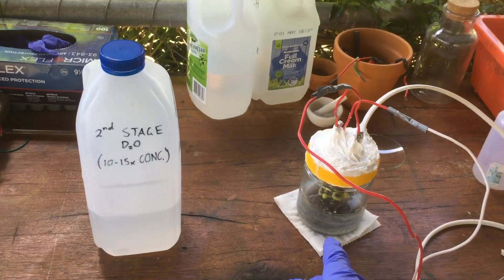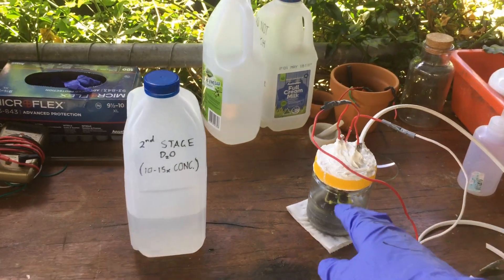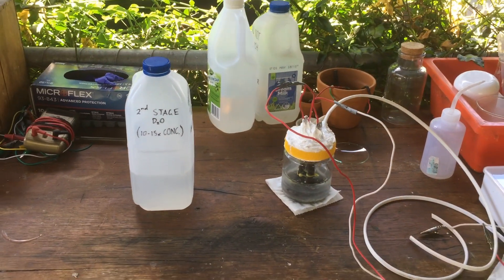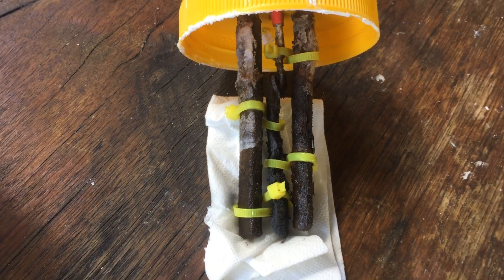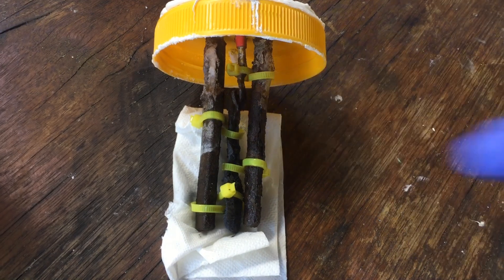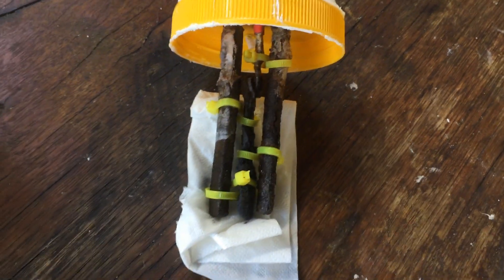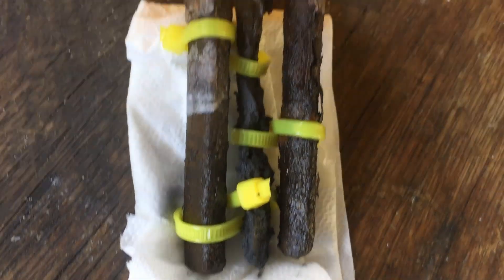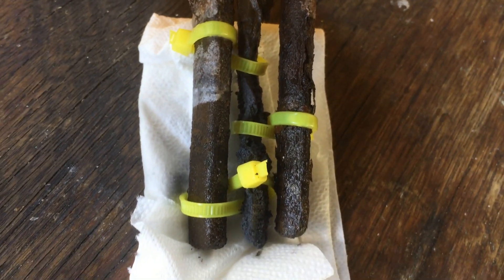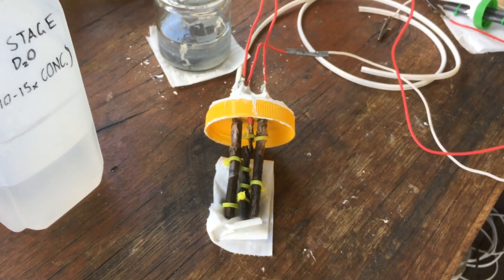I'll go ahead and pour the remainder of that water in here, and then we'll continue electrolyzing down in that jar. If we have a look at the electrodes as well, just taking them out, you can see they've fared pretty well compared to the other electrodes I've had previously. All this white stuff would just be the sodium carbonate crystallising out on the top. We've got the cathode in the middle and the anodes on the outside. The cathode has been getting a little bit of spongy lead over the surface, but it should survive until we can get it down to 100–200 millilitres.